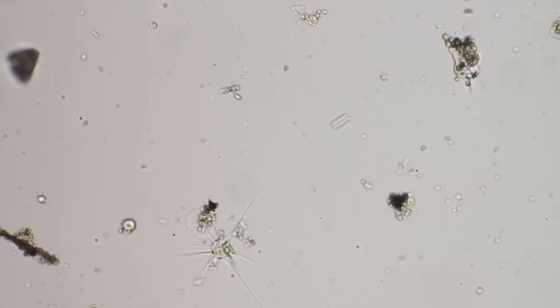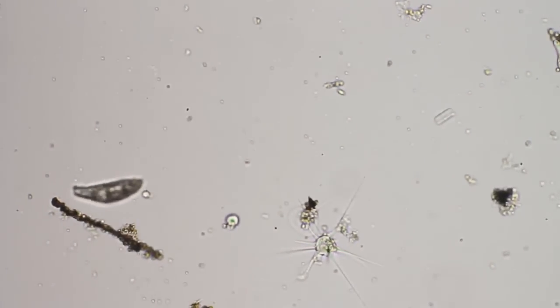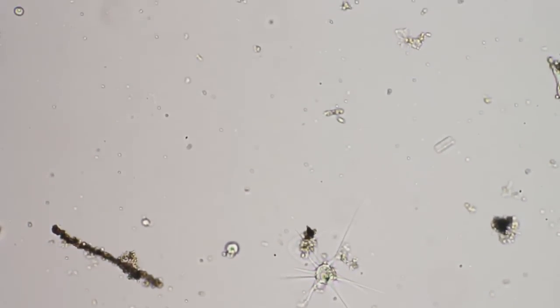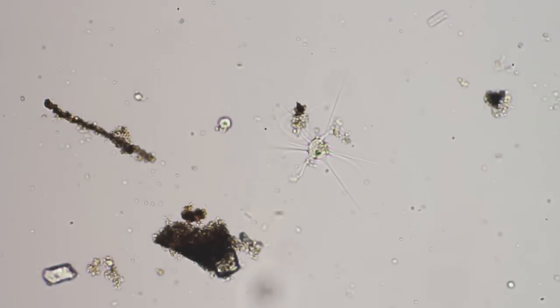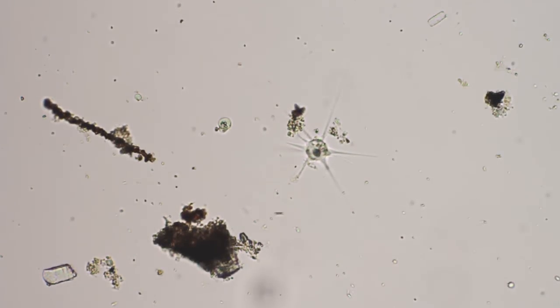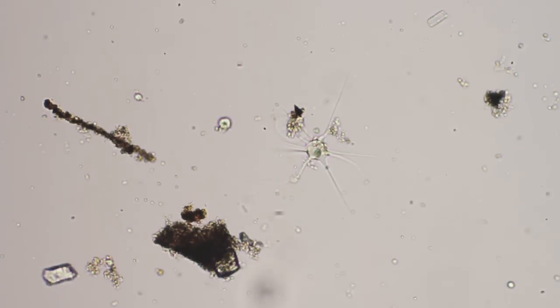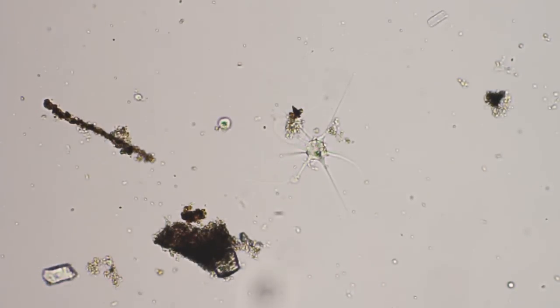Now I'm going to bring the star at the bottom back into the center here and get a better look at him. Under 40 power. Let's go to 40 power here for a minute and see how that looks.